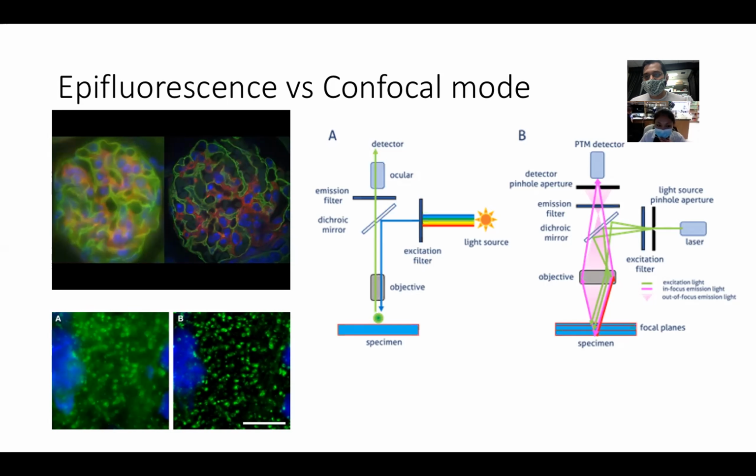Exactly, that's exactly why you see this haze, the haze with the green. Okay, that makes sense.